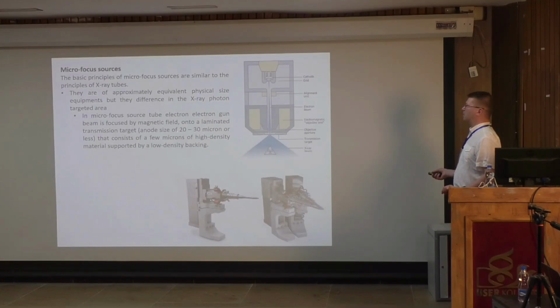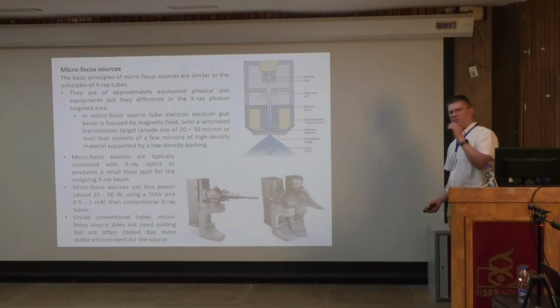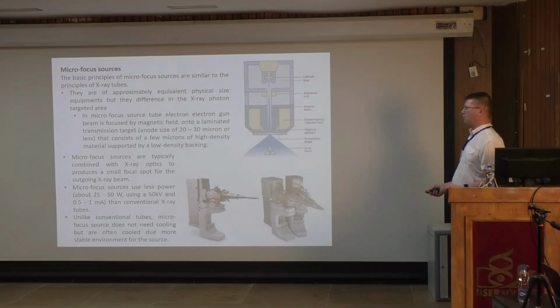And the point in there is that they operate at about 40 watts. So we still need the high voltage because we need the speed of the electron, but now we don't need to have huge power for it, so it's like a light bulb. And now it looks like this. So the X-ray tube is inside here. This is optics. The X-rays come from this side.